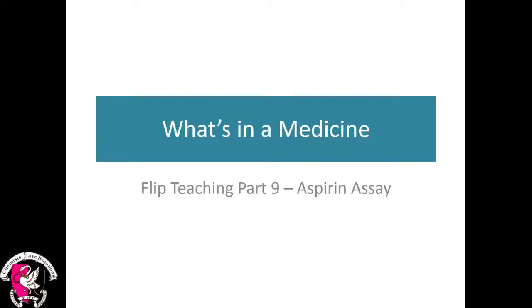Okay, so today we're going to be doing a bit of preamble for WM9. What you're going to be doing in class is actually a titration to analyze the purity, or the amount, of aspirin that's contained in an aspirin tablet. That's basically called an aspirin assay. You're analyzing the aspirin tablet to determine how much actual aspirin, so acetyl salicylic acid, there is in that tablet.